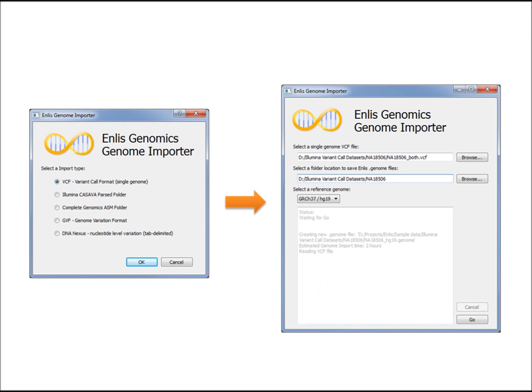Getting data into our software is very easy with our Importer program. You simply tell the software what type of data you have, point it at a location, and hit the Go button. The software will import the variations, annotate them, and create an Enlis.Genome file.